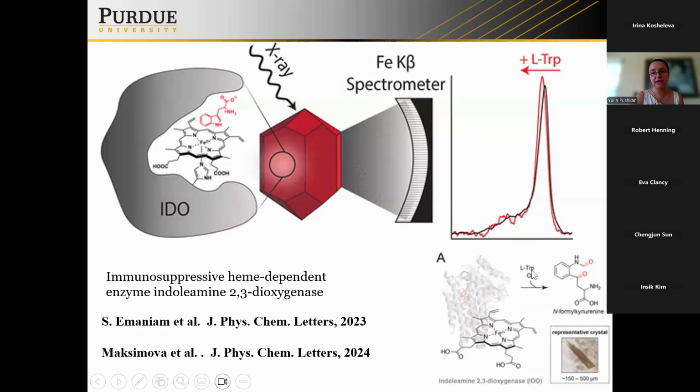The tryptophan is a substrate, and there is a spin change. With iron it's a little bit tricky, because iron 2 plus and iron 3 plus don't have that much shift in this particular line. But if you change the spin, it has a big shift. So if you have a protein where you think the iron is changing spin state, that would be a fantastic thing to study.